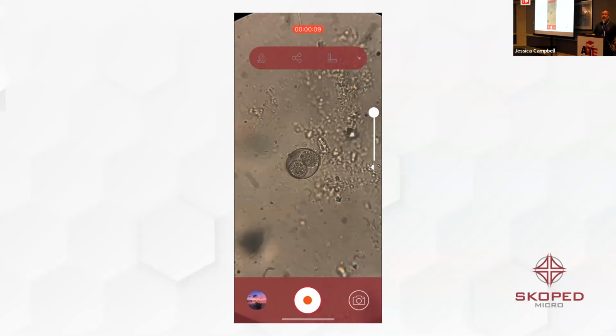Even in a client situation, I had a couple of clients who said, I want to see what's in there, or my husband wants to see. Download the app. They would have to pay at that point. But they pay the 50. No, 50 for any .edu, teacher or student, period.